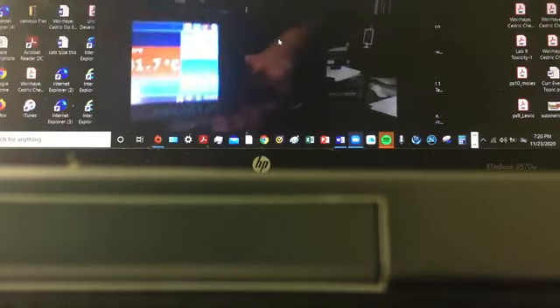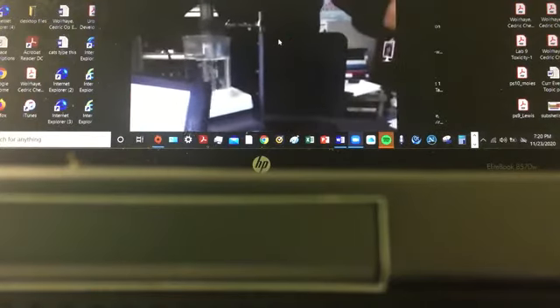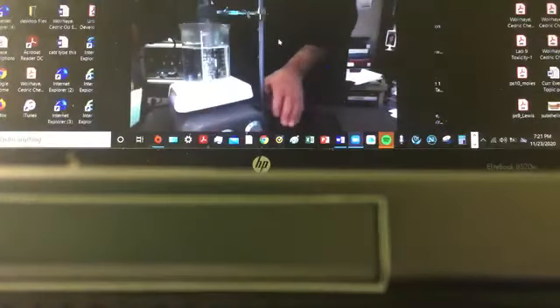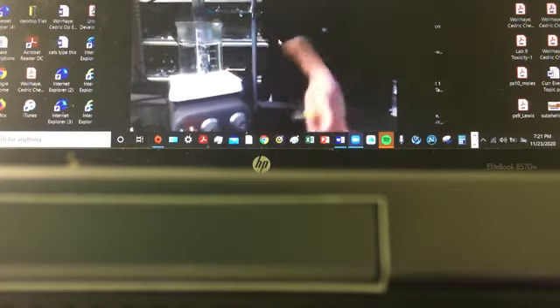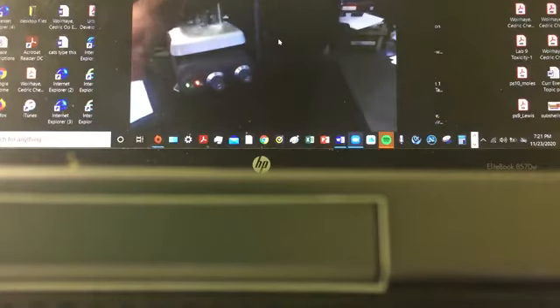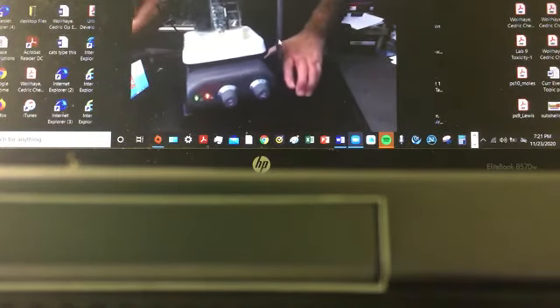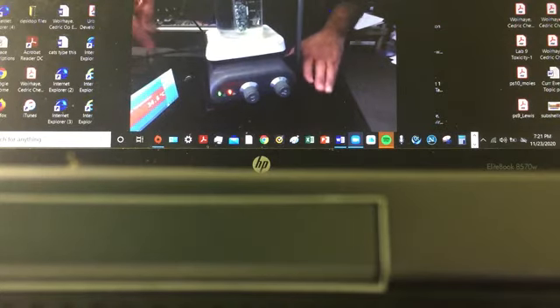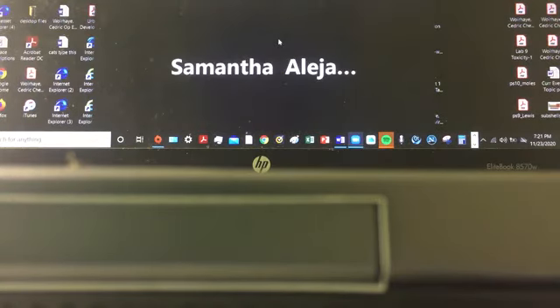See it? So that's the temperature inside the metal. So inside the metal, the temperature is still cold. Now it's rising up. So let me put that in the background to be able to see both. Can you see that temperature? That is the temperature of that metal inside that test tube.